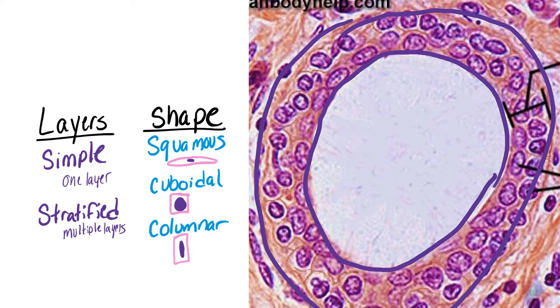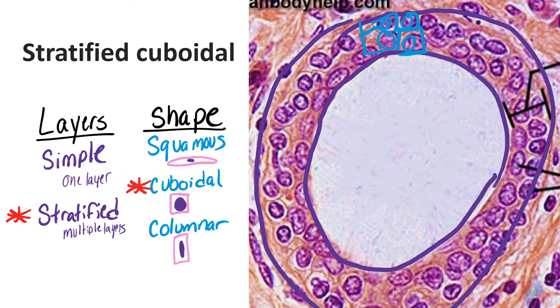We have two rows of nuclei here, which makes this stratified. And although you can't see the shape of the cells clearly, you see those circular nuclei, so you know it's cuboidal, which makes this stratified cuboidal. If you go to the school that I work at, please scrub this term from your head, because it is not in your lab book, and if you put stratified cuboidal on your test, it is wrong. However, it is an epithelium that exists, so I am including it here.